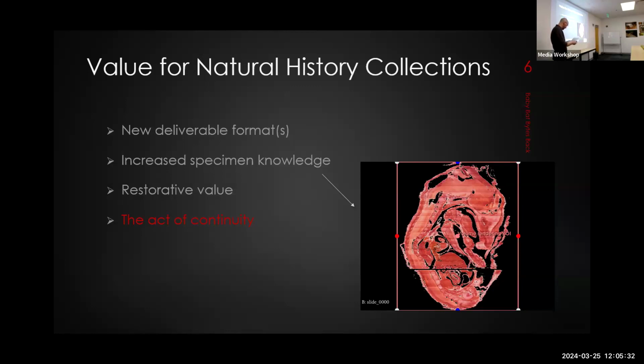For example, the horizontal striations visible in this cross section here give us a clue about staining technique, which we hadn't noticed before. The number of horizontal bands corresponds to the number of slides in this series, and we think that the darker areas of those bands are indicative of more stain being applied to the first sections on the slide than the final sections. So you end up with this kind of real striated appearance.